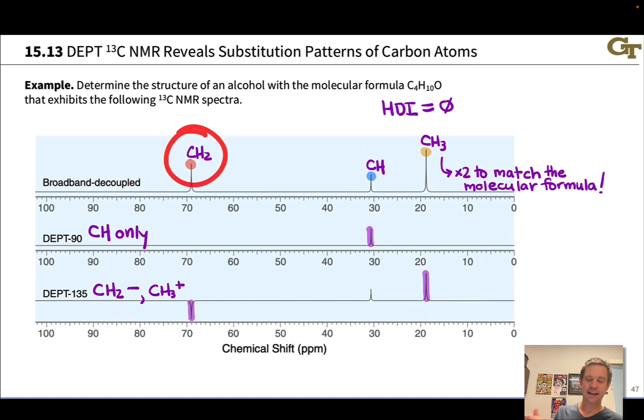I'm thinking an isopropyl group might be in this thing. Notice also that this CH2 is way downfield, way deshielded relative to the CH and CH3. This suggests that this is close to the oxygen atom. Perhaps we have an OH group connected to this CH2, which is in turn connected to this CH and the isopropyl group. The resulting structure would look like this.